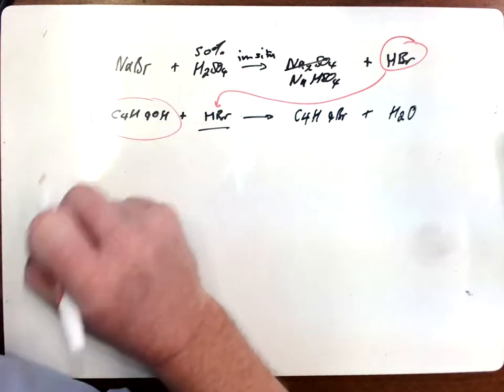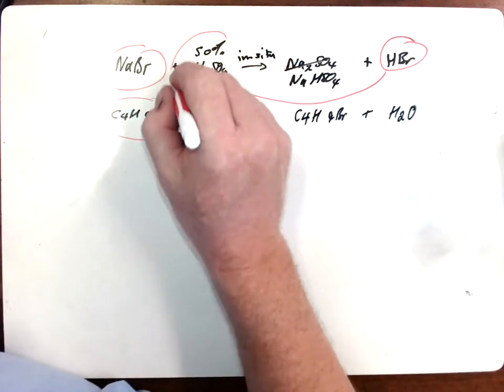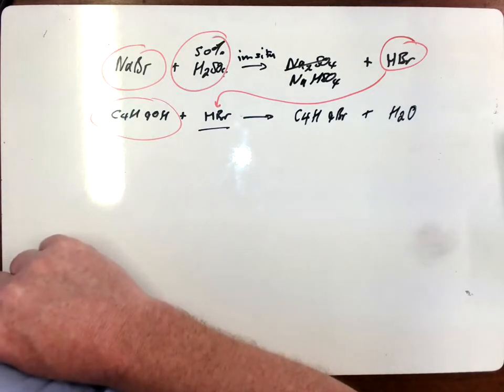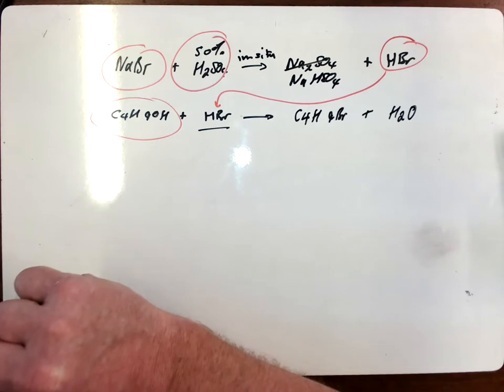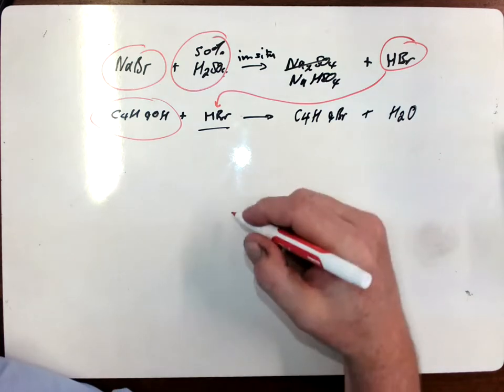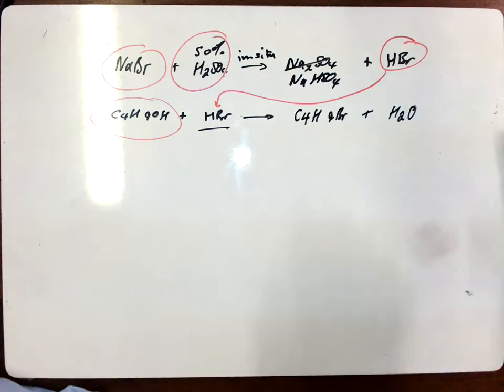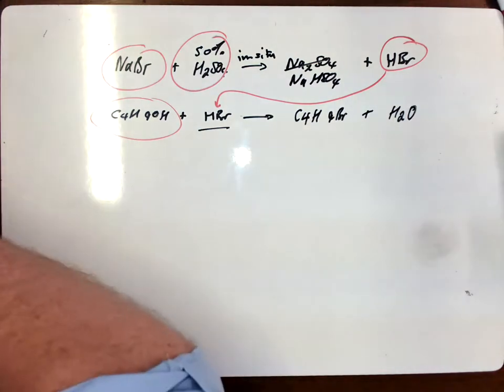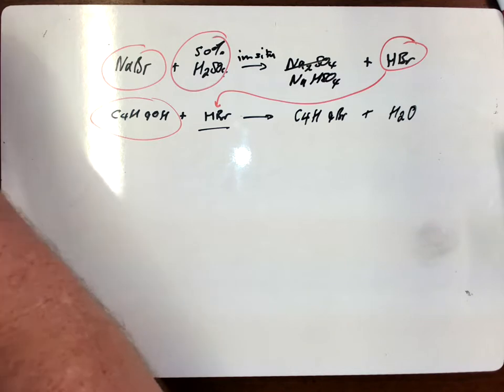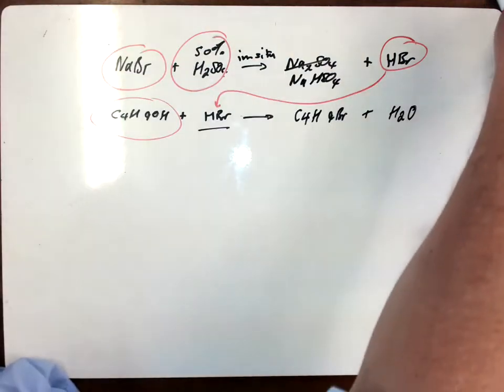Okay, and our butan-1-ol will be in there with the sodium bromide and with the sulfuric acid, and this reaction will then take place. Now, it's not quite as simple as what we would have done at GCSE, where you just added these things together and got product. There's a little bit more to it in this case. Now, when I have my pear-shaped flask, I need to obviously add all of this, but there's a problem here in that whenever we add the conc sulfuric acid, this reaction can get extremely exothermic.